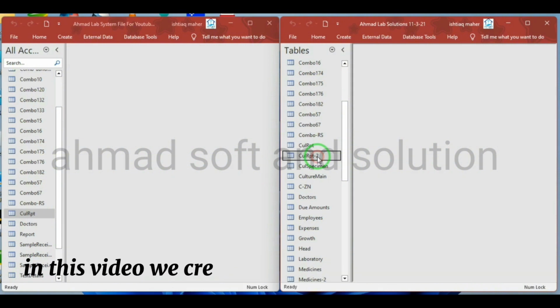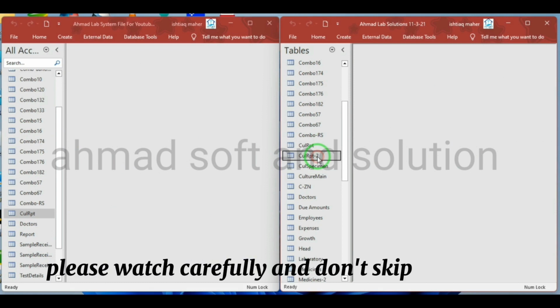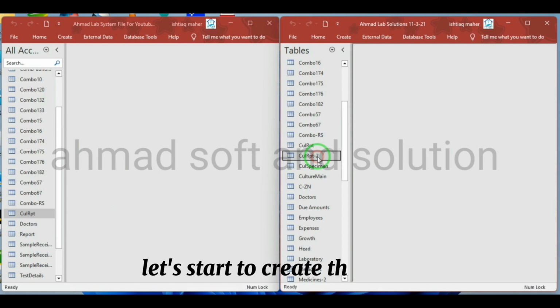In this video we create more tables for this software. These tables are very important for you. Please watch carefully and don't skip the video. Let's start to create the table.